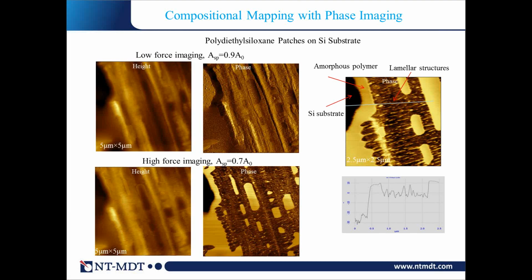It's a really good measure of the differences of materials, but to convert that to numbers, people haven't succeeded in the last 20 years, and I doubt they can do it, finally, because the phase is like a staining agent in electron microscopy. It shows you differences, but quantification is extremely, extremely difficult, if possible at all.